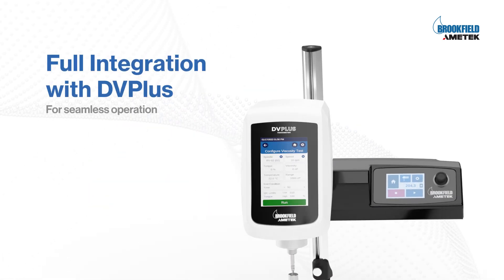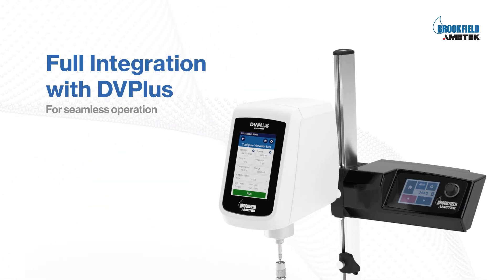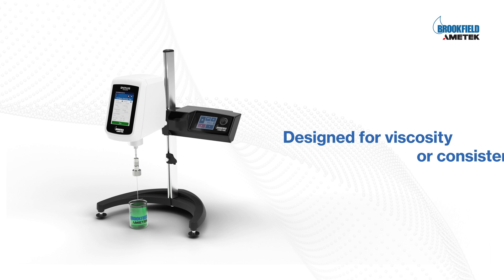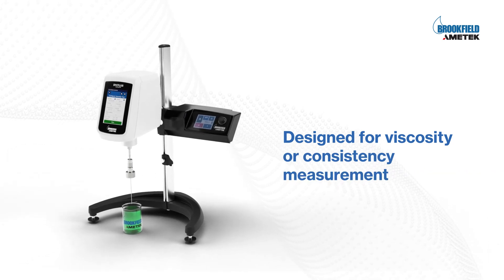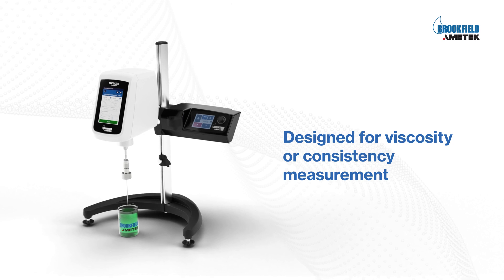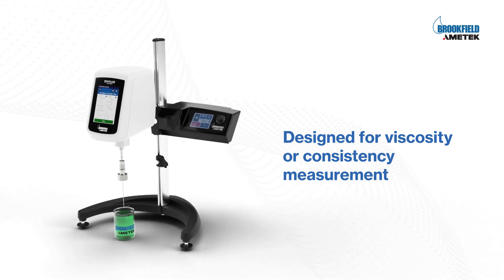Full integration with DV Plus for seamless operation. Designed for viscosity or consistency measurement of materials that are sometimes difficult to measure, like gels, pastes, creams, putty, and other non-flowing substances.